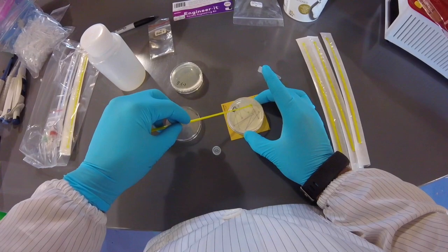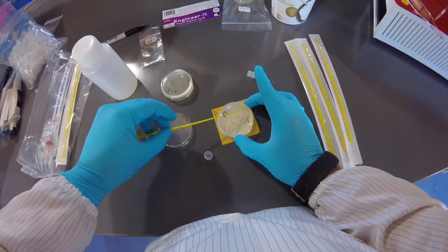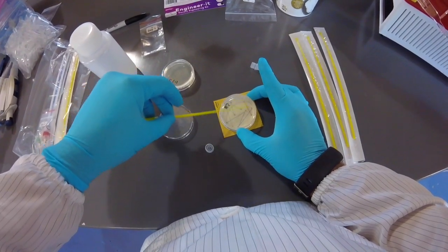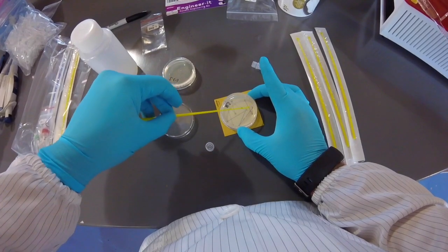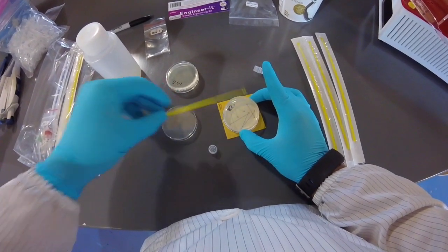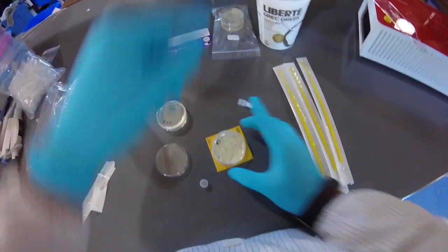So I'm just going to, at a strong angle here, kind of like maybe you'd paint something, rub across this first line. You can just go A to B if you want, or you can just go back and forth a few times on that line. Okay, make sure you get lots of bacteria on that first line. That's fine. Okay, and then I'm going to put that into my discard container.